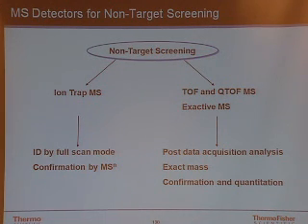In the 20 years I spent with Hewlett-Packard, we spent 20 years working on time-of-flight mass spectrometers, and they are definitely a development in the field of analytical chemistry. But they're no longer the state of the art because there are many problems, such as molecular weight calibration, which is a very big challenge for those mass specs.